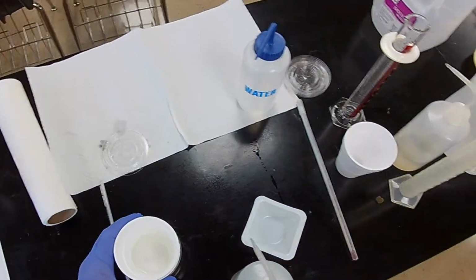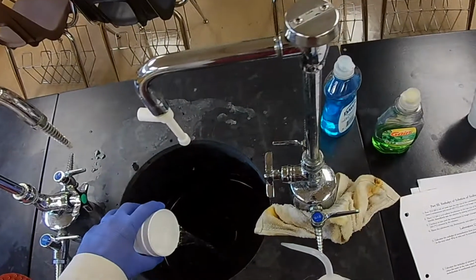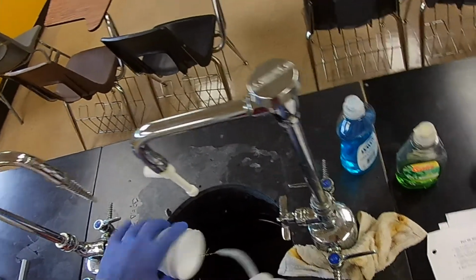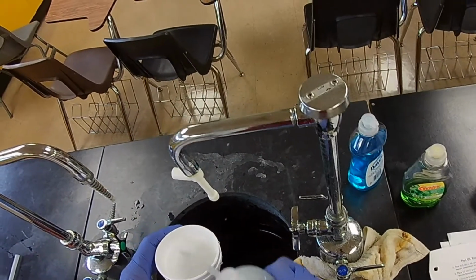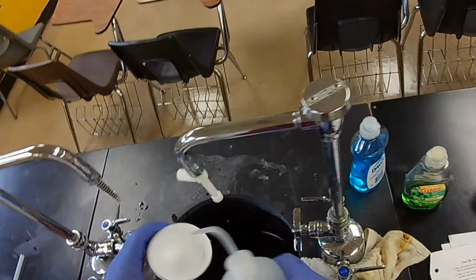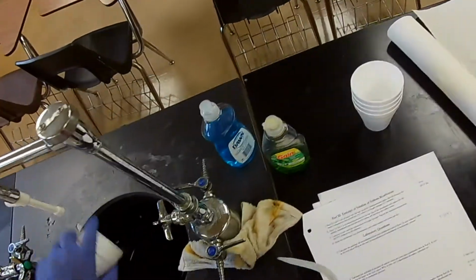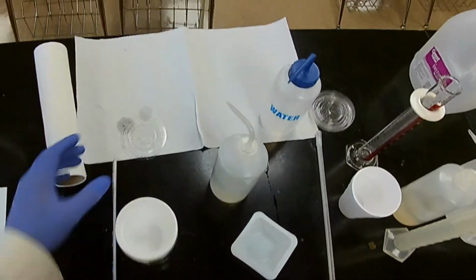Okay, and then sodium carbonate is harmless at these concentrations. Okay, so now we have ready for the next step.